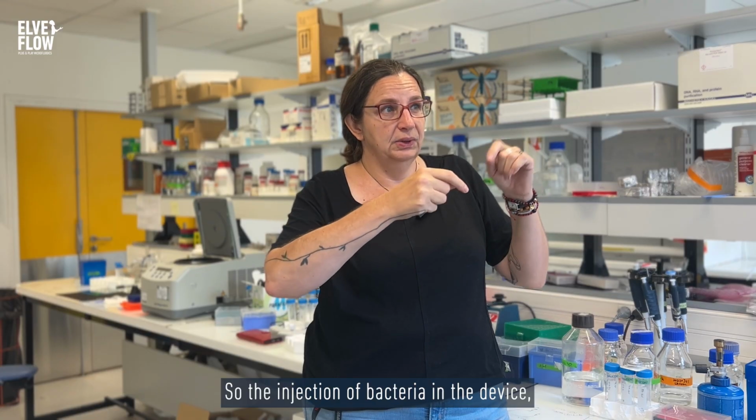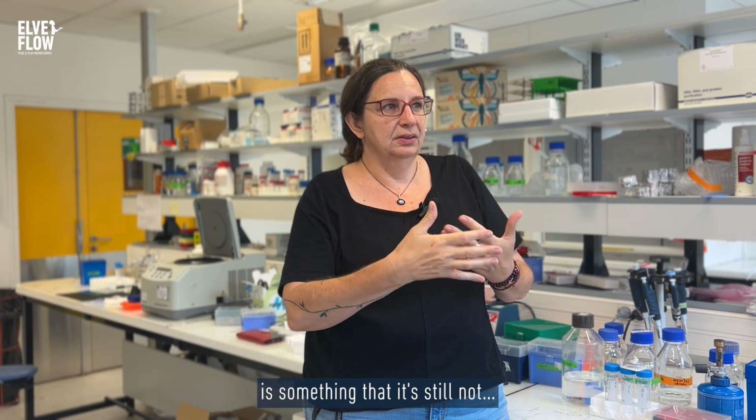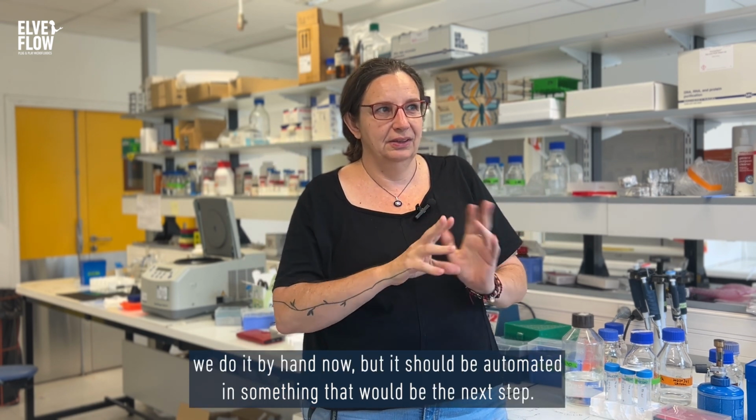So the injection of bacteria in the device is something that is still not automated. We do it by hand now, but it should be automated, and that would be the next step.